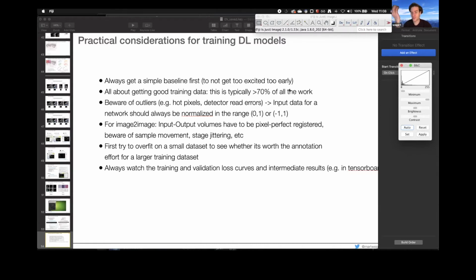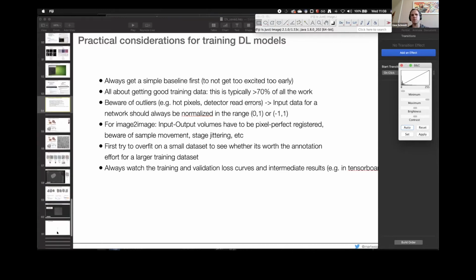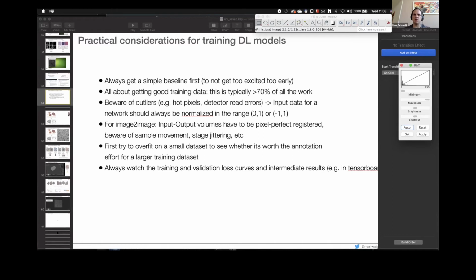But it's worth a try, because it's essentially something that you can get very quickly. We had that at some workshop. Somebody used the watershed and used it for training StarDist, and StarDist actually fixed some of the mistakes in the watershed. So it can really work. As Martin said, if you have two shapes that the watershed merges, which are not star convex, then StarDist cannot make this mistake by design. So you get this split automatically. So it's worth a try.